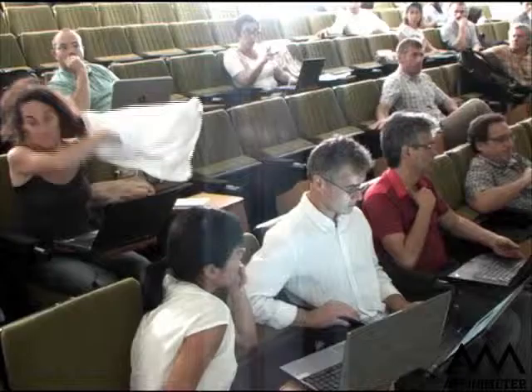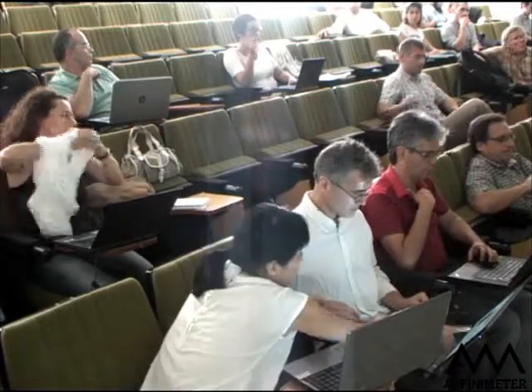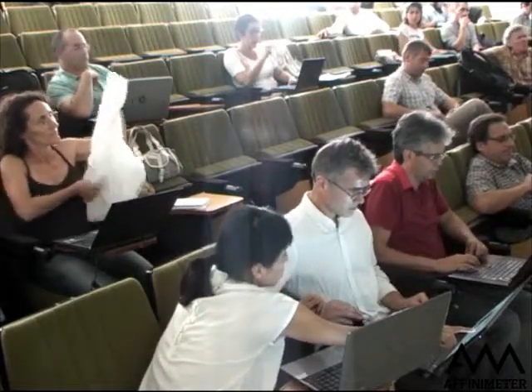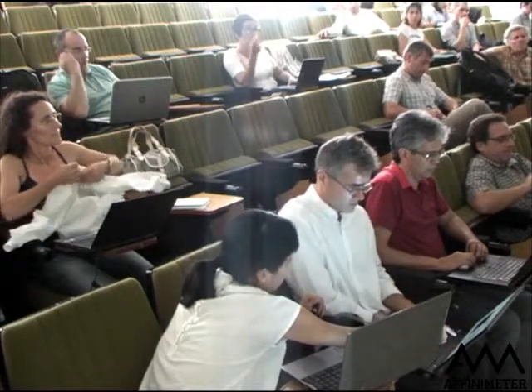Well, it's just some indication on the delta H sign: is it going to be the one for the dissociation, or does it not have that implication? No. So the opposite sign. Well, it's just a matter of how to name the model. In the reaction builder, we have the equilibrium, the scheme, and the information you obtain later on depends on your experimental setup.